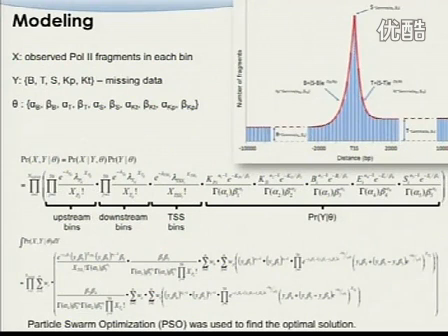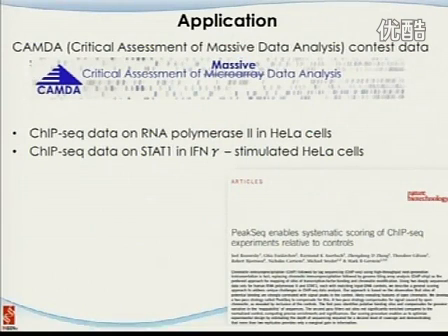And then we divided this region into multiple bins, and each bin is about 200 base pairs. And we use a Poisson model to model the whole process. Okay? If anyone has interest in the equation part, we can talk about it offline, and I'm not going to talk about it here. Right? We may have a quiz after this to solve these equations. Probably not, so don't worry about that.